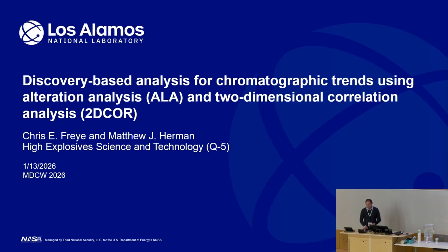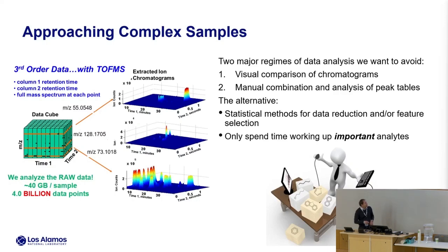So we're going to change gears here a little bit, and we're going to talk about math and its application to chromatography. Two high points that both Haley and Zach mentioned: multidimensional chromatography yields complex data. For some simple analysis, maybe we can look at the chromatogram visually and say, hey, there's an obvious change there.